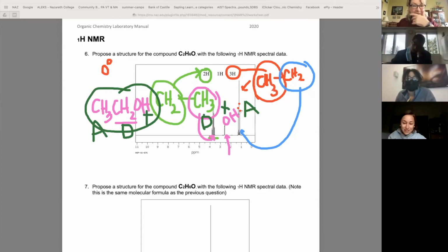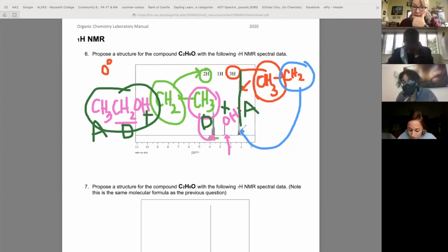No, you're fine. I'm just trying to figure out. So the final answer is CH3, CH2, OH, and then you just score. Okay, because everything was jumbled. Yep, this CH3 came from this signal right here. CH2 came from this signal right here, and the OH came from this signal right here.